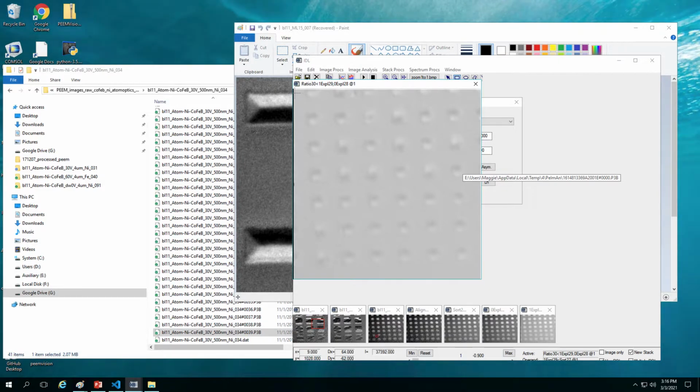See, when we have some alignment happening and now the side is black, it means that we have some drastic movement during some movement. So if you wanted to recover the real contrast, you want to leave the side out. Okay.